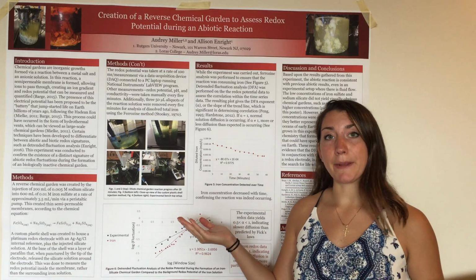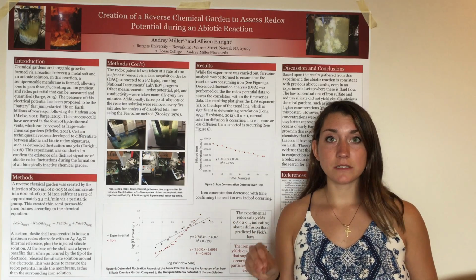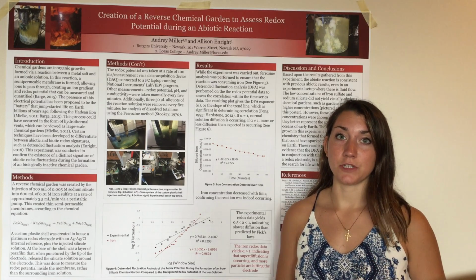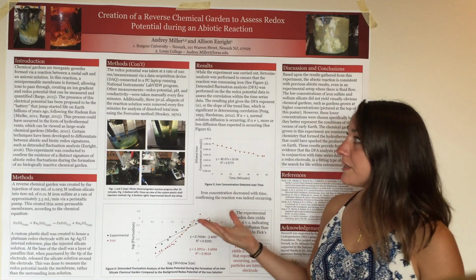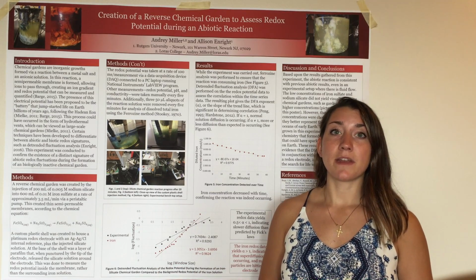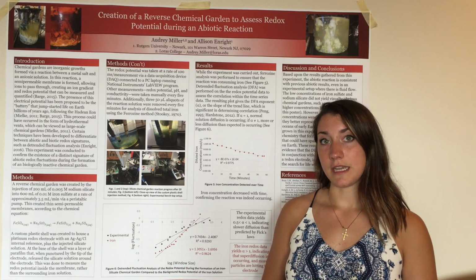So in the case of this experiment, our metal salt was an iron solution and our anionic solution was a sodium silicate solution. Now the reason that we chose this experiment to perform is because there's been a lot of research done on chemical gardens lately.